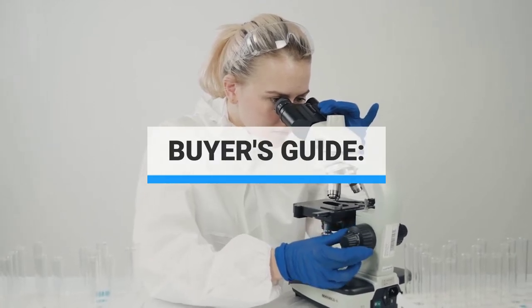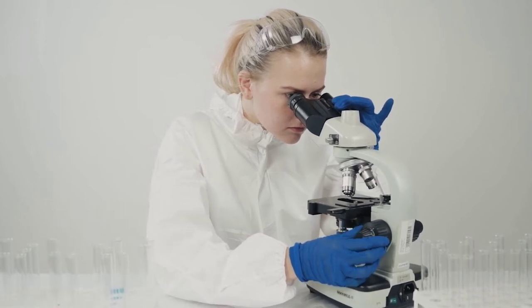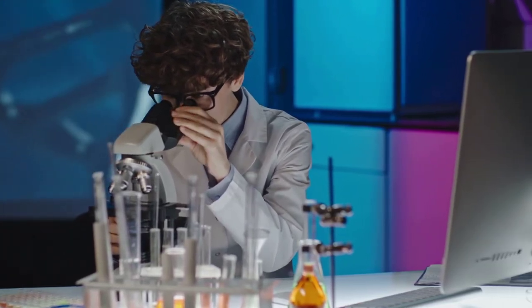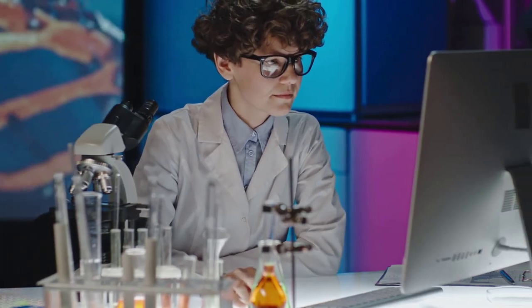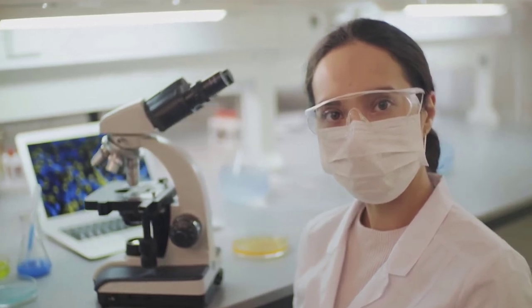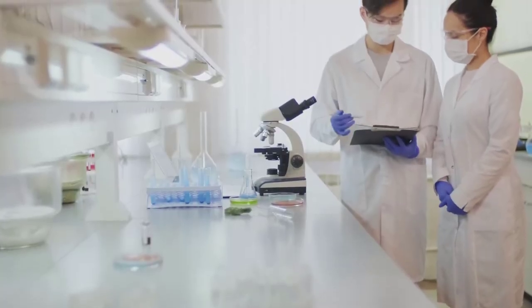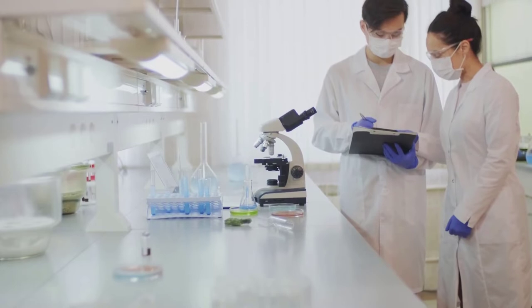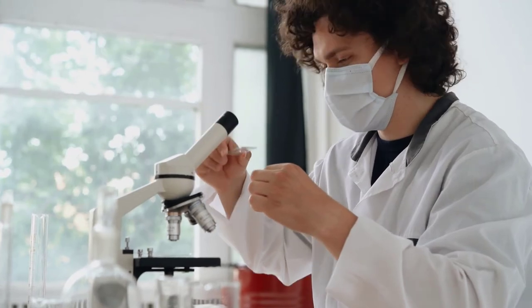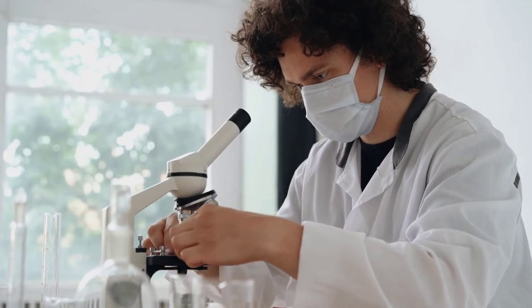Buyer's Guide. A USB microscope is a great tool that can be used by kids and adults who want to explore the microscopic world without investing in a high-end microscope that can cost thousands of dollars. Important things to consider include image quality, screen size, zoom, features, and price. Image quality should be a top priority — these microscopes let you save images and videos, so look for high resolution. It is always better to have a 12 MP USB camera than a 2 MP USB microscope camera.